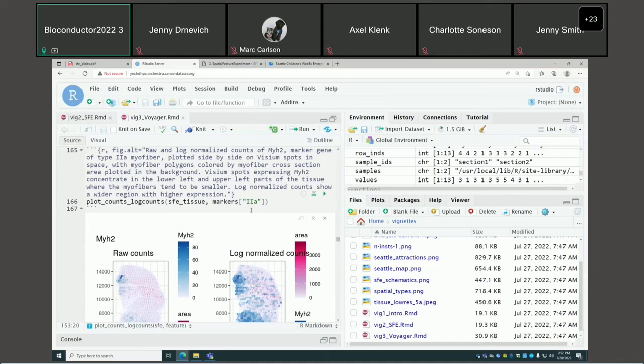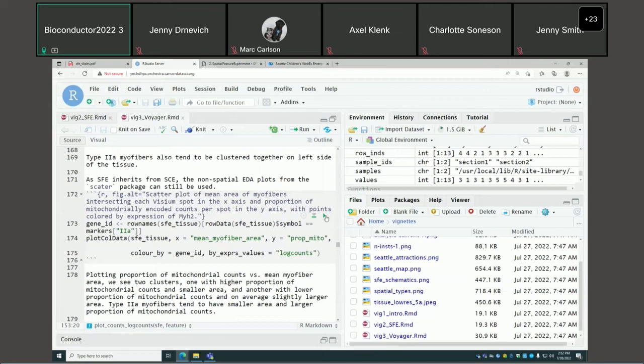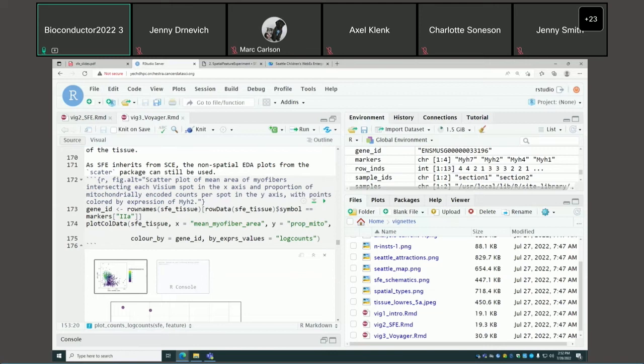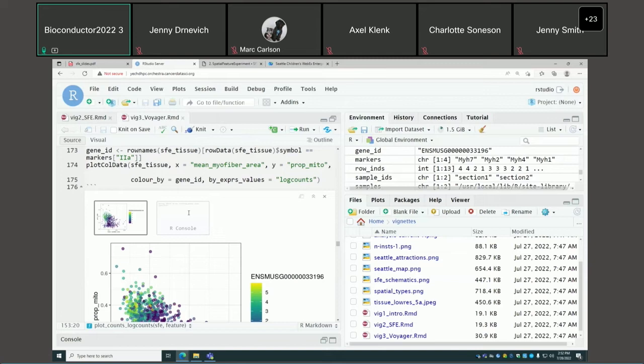This is for type IIa myofibers. For those interested, in Orchestra you can change the code to plot type IIb or type IIx. Since the SFE object inherits from SCE, all the non-spatial EDA plots from scater can still be used.